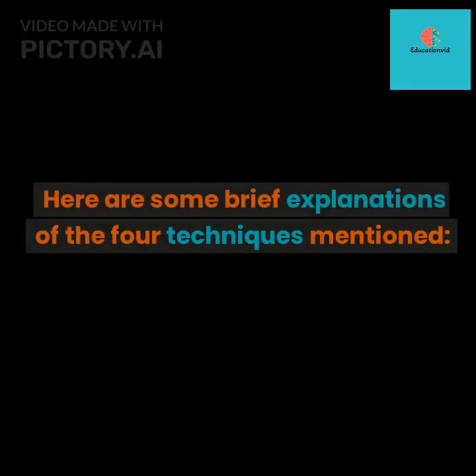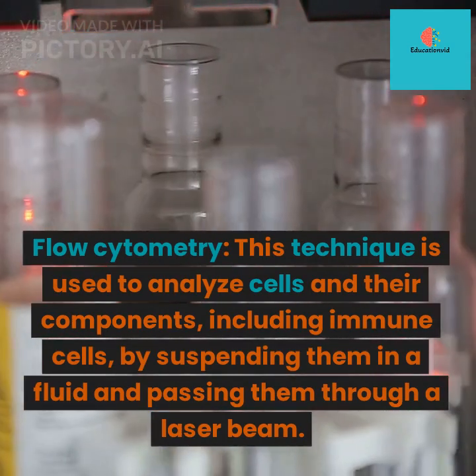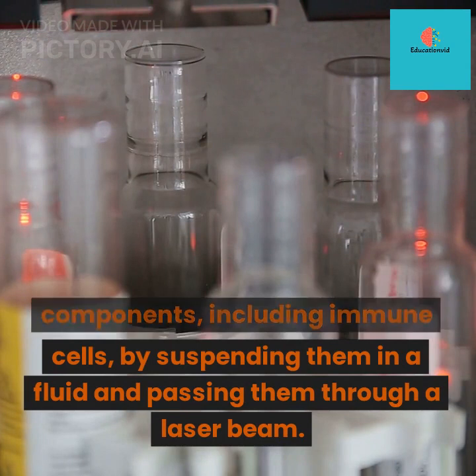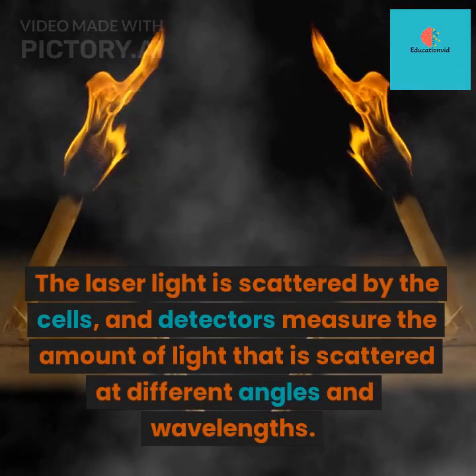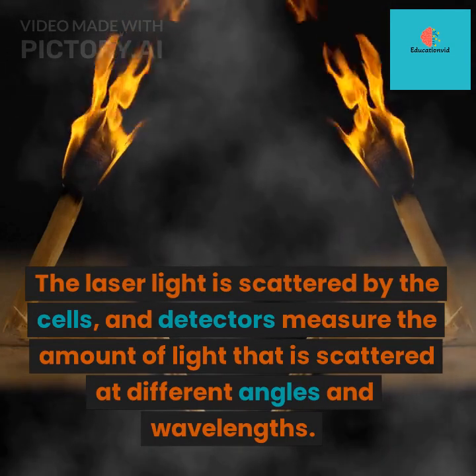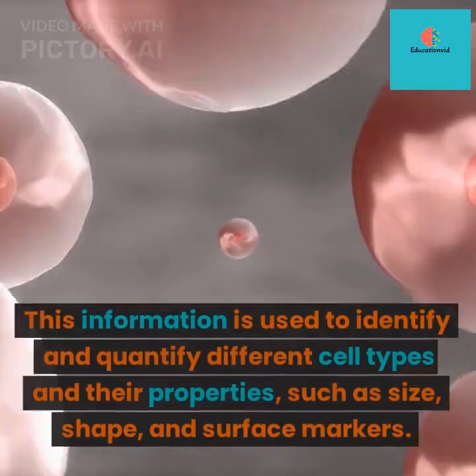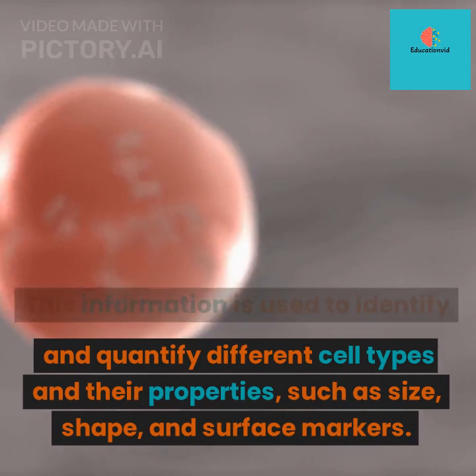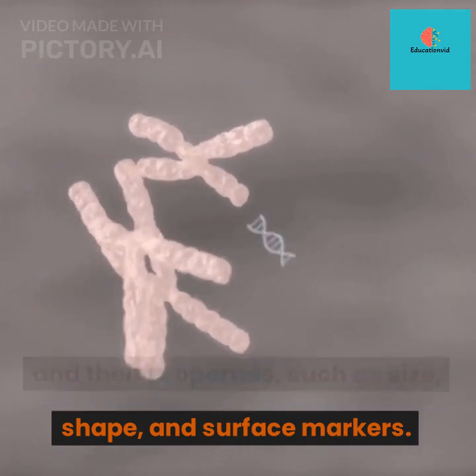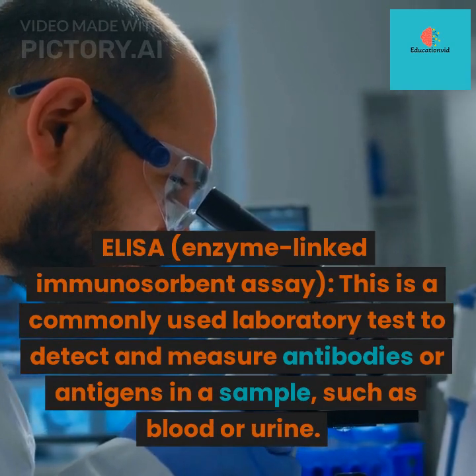Here are some brief explanations of the 4 techniques mentioned. Flow cytometry. This technique is used to analyze cells and their components, including immune cells, by suspending them in a fluid and passing them through a laser beam. The laser light is scattered by the cells, and detectors measure the amount of light that is scattered at different angles and wavelengths. This information is used to identify and quantify different cell types and their properties, such as size, shape, and surface markers.